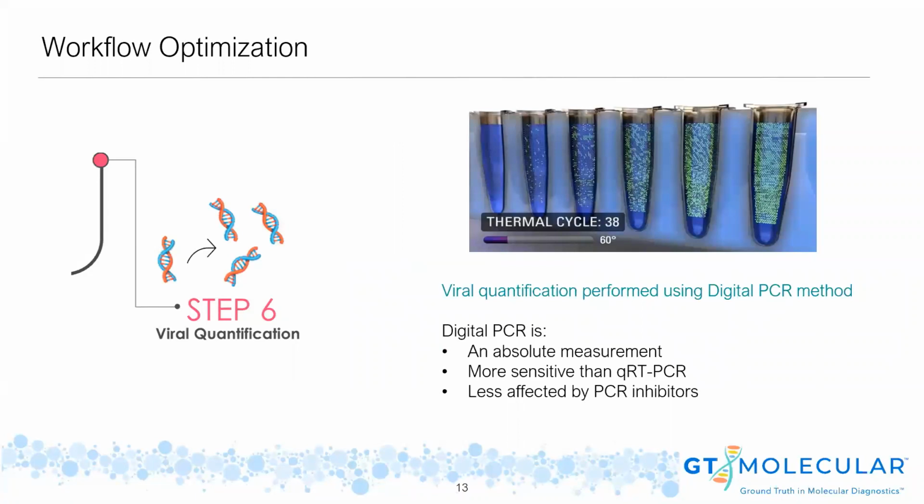These droplets are then allowed to cycle for amplification and are read individually by a microfluidic empowered imaging system. The important takeaway from this discussion is that running a single sample in droplet digital PCR is like running the sample in 20,000 replicates, and thus provides unparalleled reproducibility and statistical power. Additionally, this technique provides an absolute measurement, not relying on a standard curve of reference material for determining concentration, freeing up more wells for sample processing and eliminating any errors that reference materials can introduce to quantification.